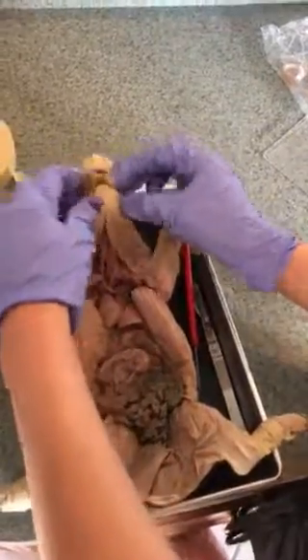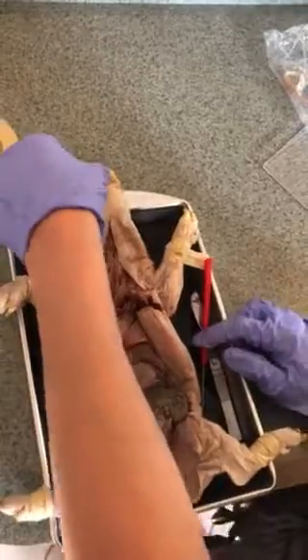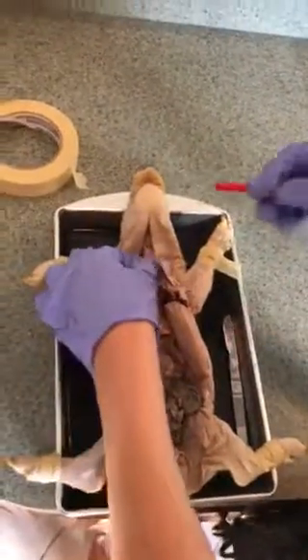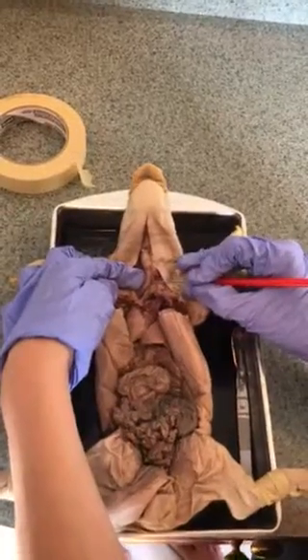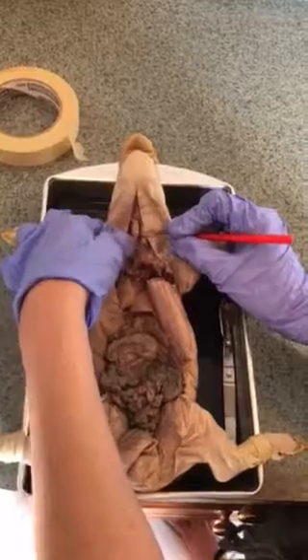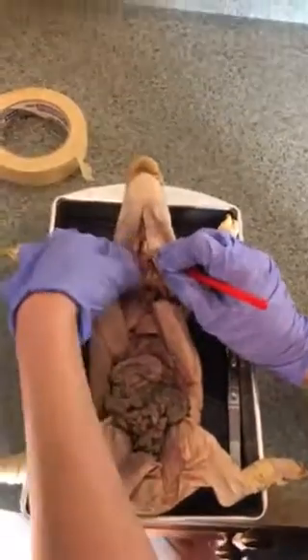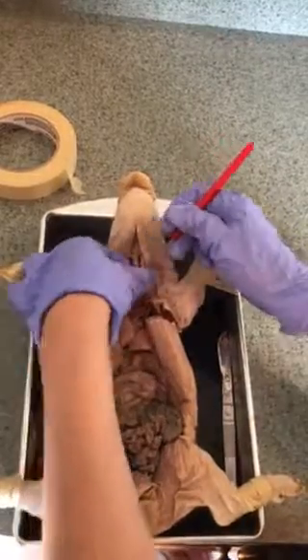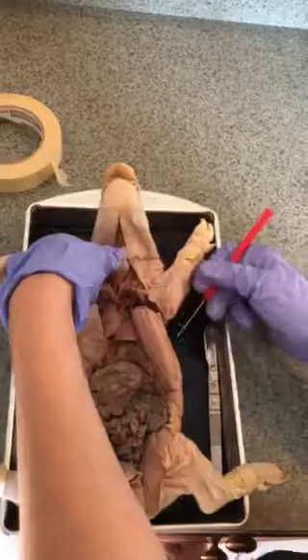We have the tongue up here that's just hanging out. We've got the trachea, and you can clearly see the hyaline cartilage. The C is made out of the hyaline cartilage. So this is a trachea that I actually cut. So you can see it comes right from the larynx and the trachea. And behind the trachea is the esophagus, and that you can see right here.